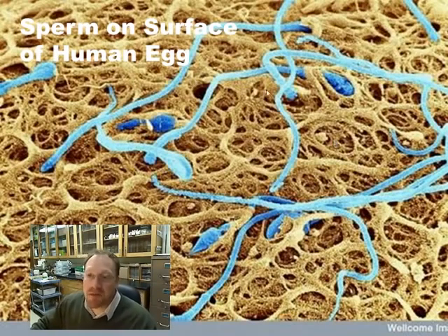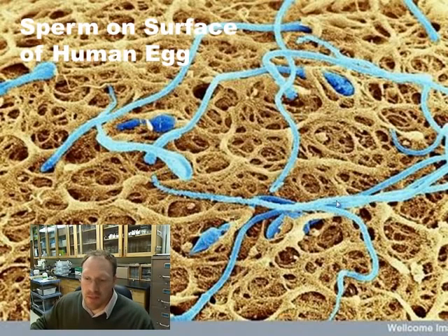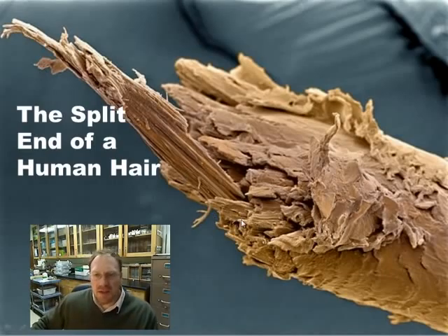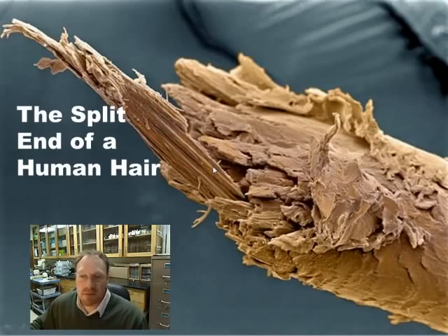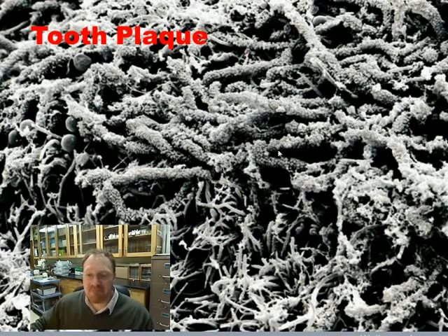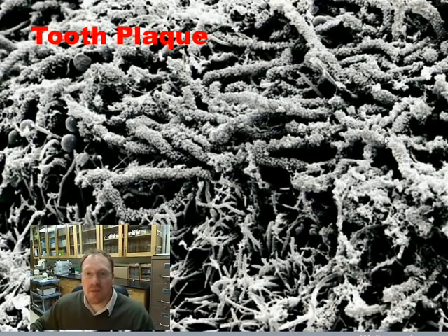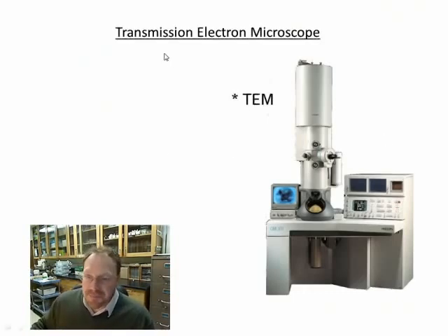This is sperm interacting on the surface of an egg cell — the sperm are obviously much smaller than the egg. This is a split end — a broken-off end of a human hair — showing a three-dimensional image. These are bacterial colonies or tooth plaque growing on the surface of a tooth. This is what grows on your teeth if you don't brush for a couple of days — it's actually always growing, and it's what makes your breath really stinky in the morning. So brush your teeth, ladies and gentlemen.